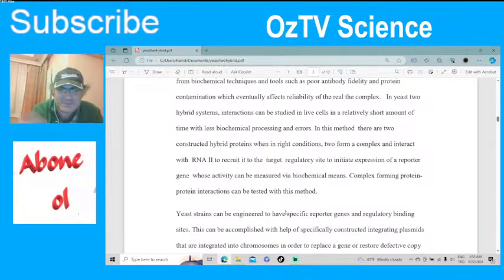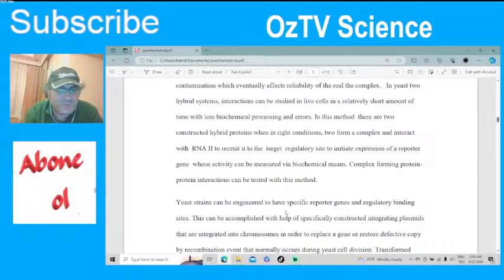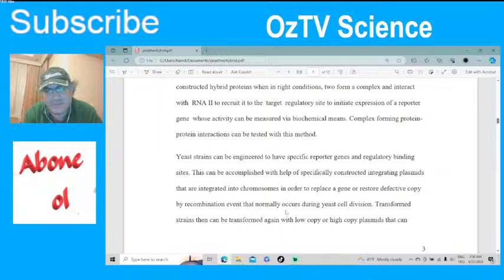Reporter gene means it changes color, and then you understand, okay, it turned on. Its activity can be measured via biochemical means, usually changing colors, etc. Complex-forming protein-protein interactions can be tested with this method. So again, this is basically a method to understand protein interactions. Very important, because our life is full of proteins.